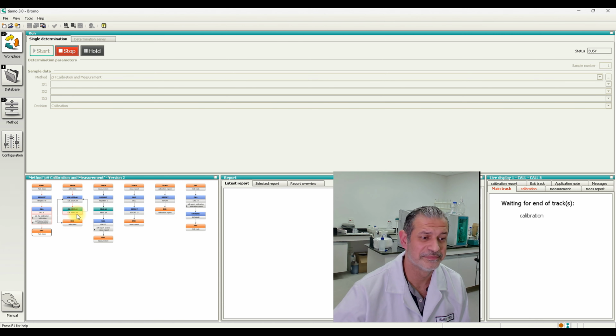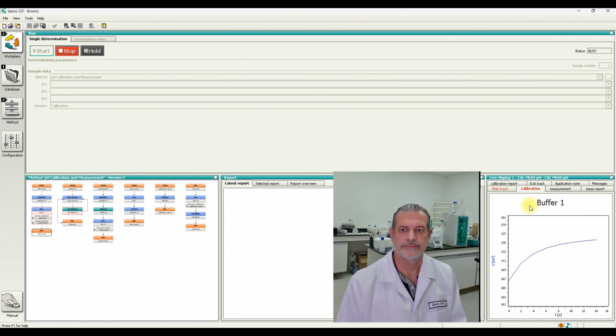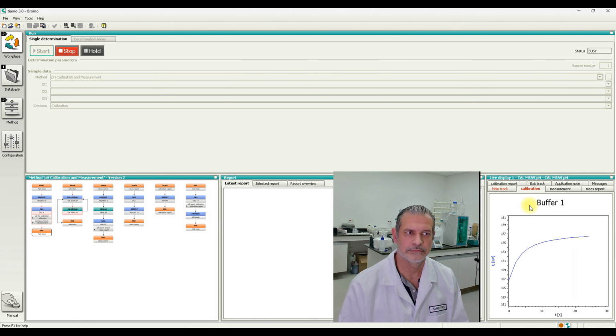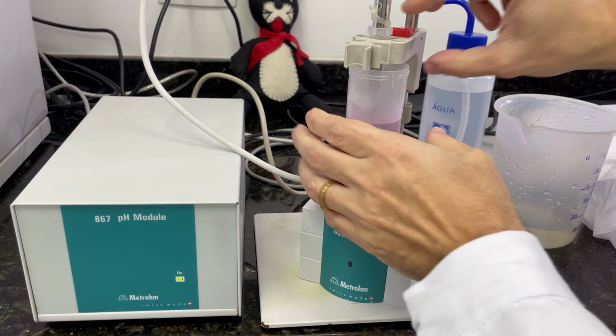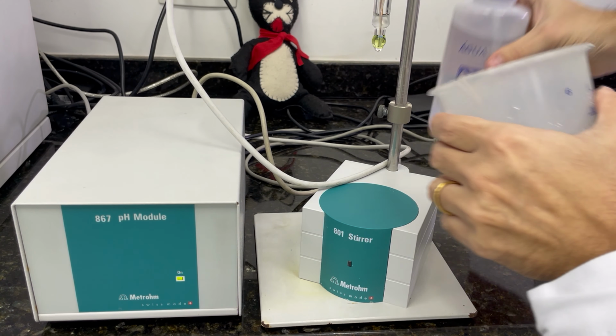it's working. Let's see here. The 4 is ready, clean.